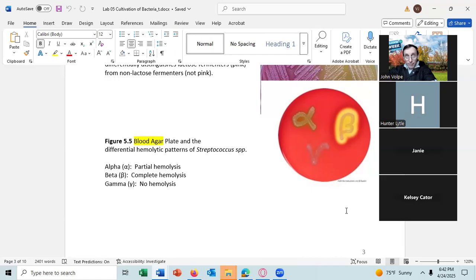It needs to have certain additives added before Streptococcus pyogenes will grow. If you add red blood cells in blood agar, you are adding the ingredients required by Streptococcus pyogenes, meaning the blood supplies it, and Streptococcus pyogenes can grow on blood agar. So it is an enriched general purpose media, and it is also differential.